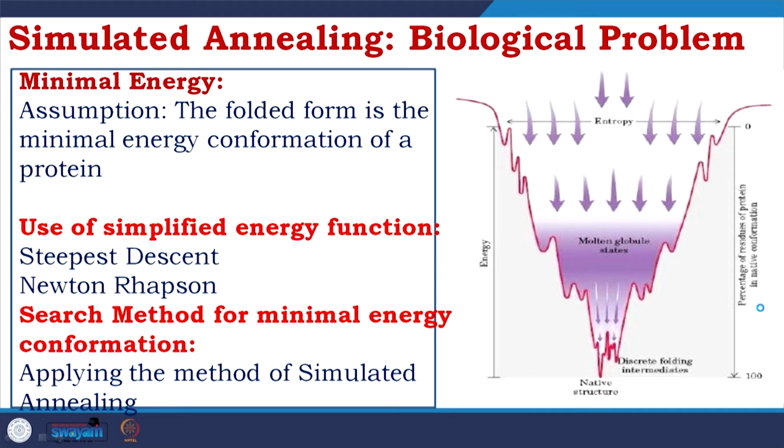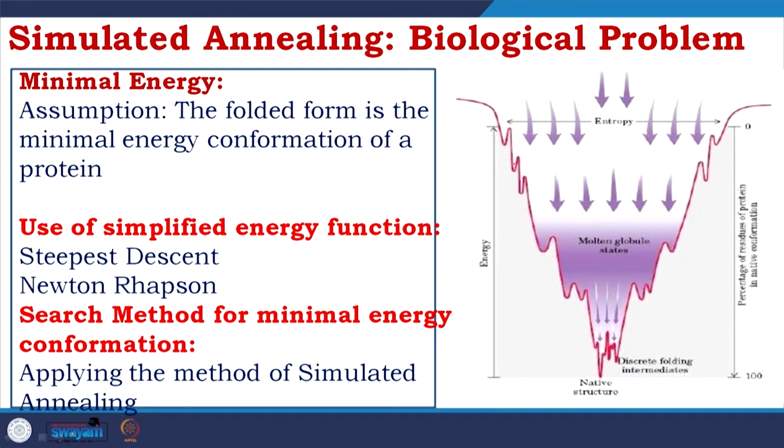So, we are talking about this, but what exactly is happening? I always try to give an example. Let us say this is your protein molecule, and it is stuck here, or here. Now, what you have to do is take it out from here.